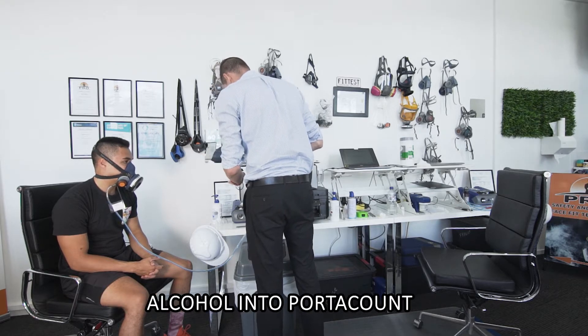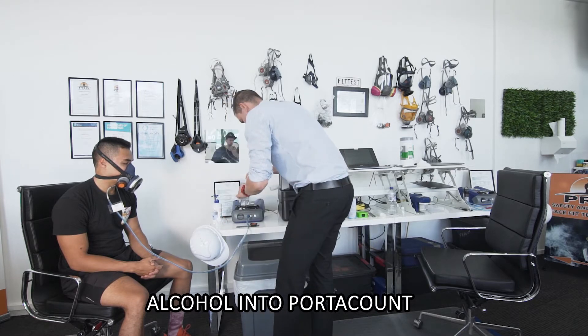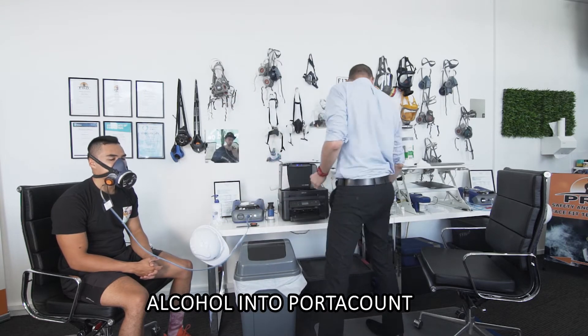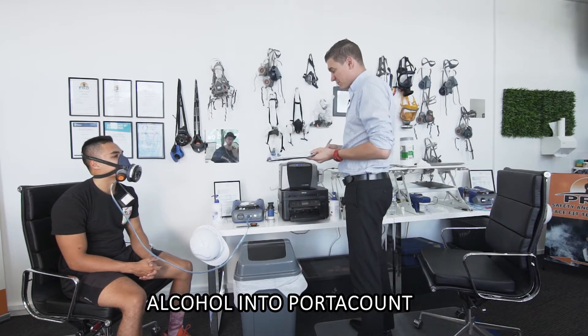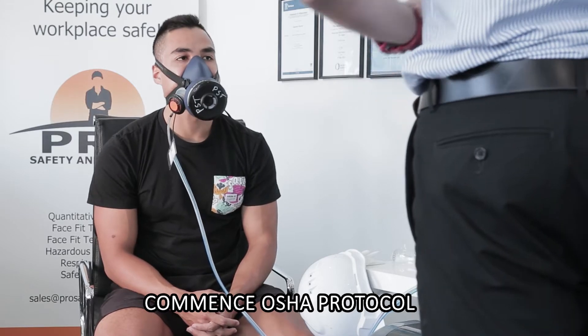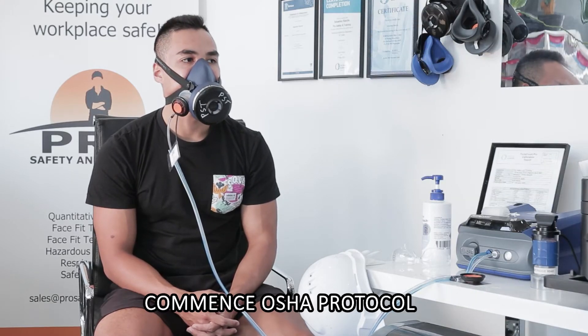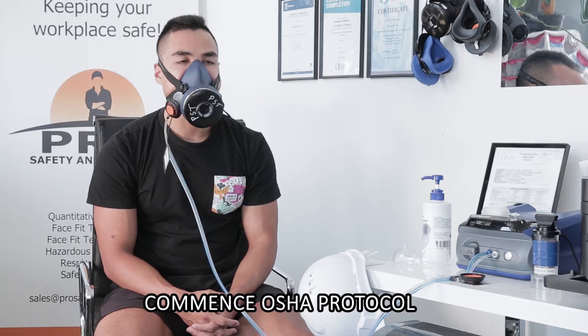We've been running a couple of tests this morning, so we'll get the alcohol in — nice and gentle. Now James, you're going to go through a basic protocol. It'll probably take five to ten minutes. We'll work our way through nice and slowly to make sure we follow the protocol. So first off, your worker initials and date — JN. Today's date is the 22nd of the 12th, 2020.